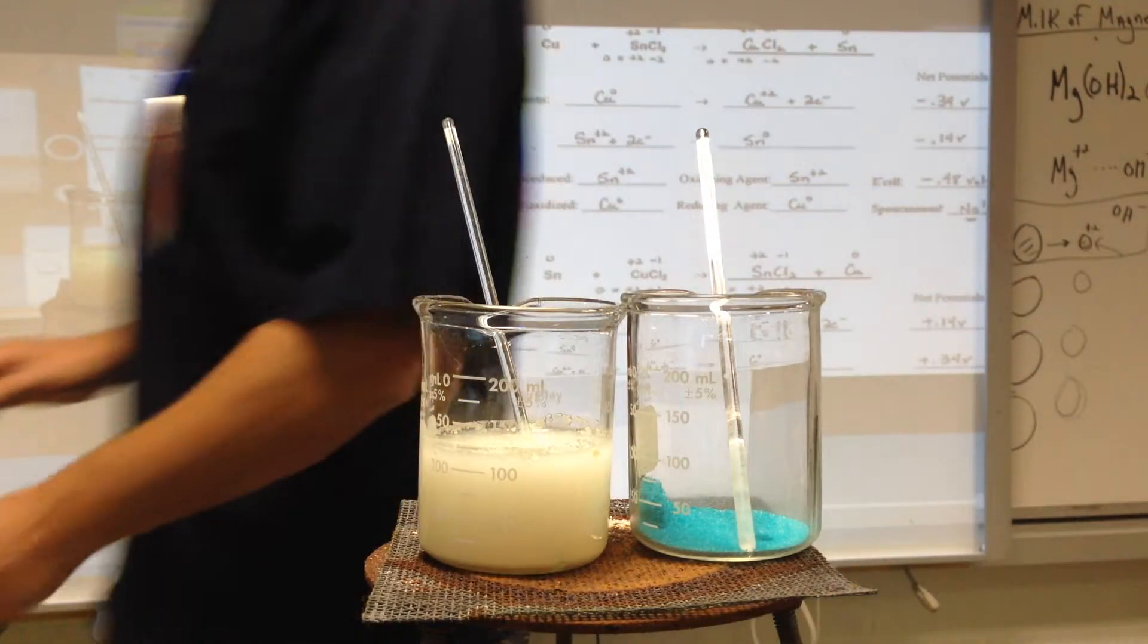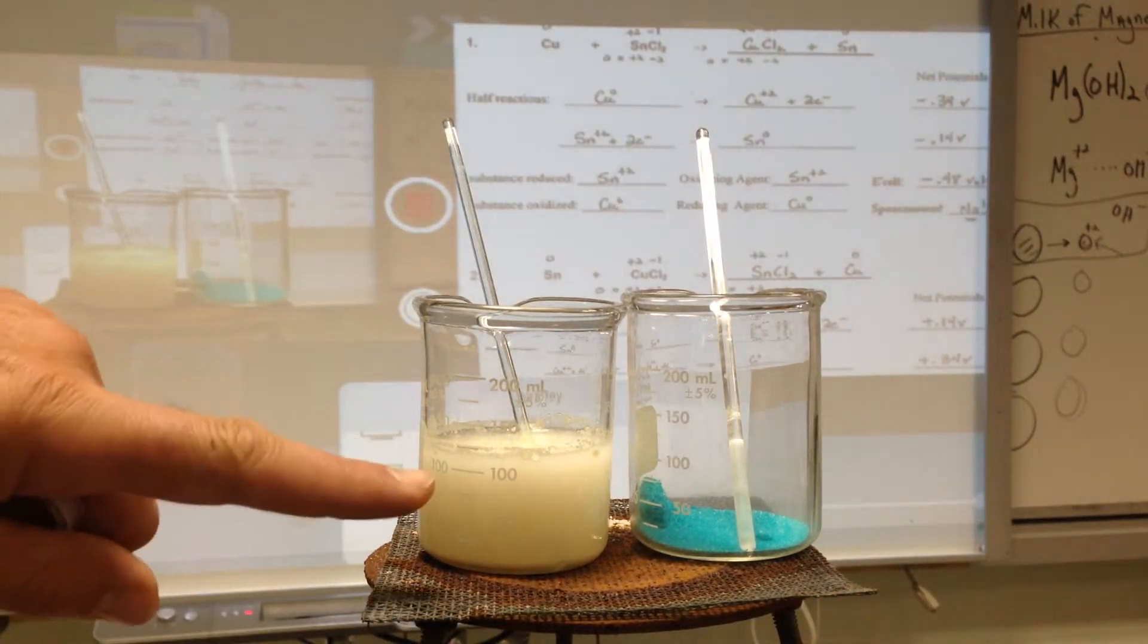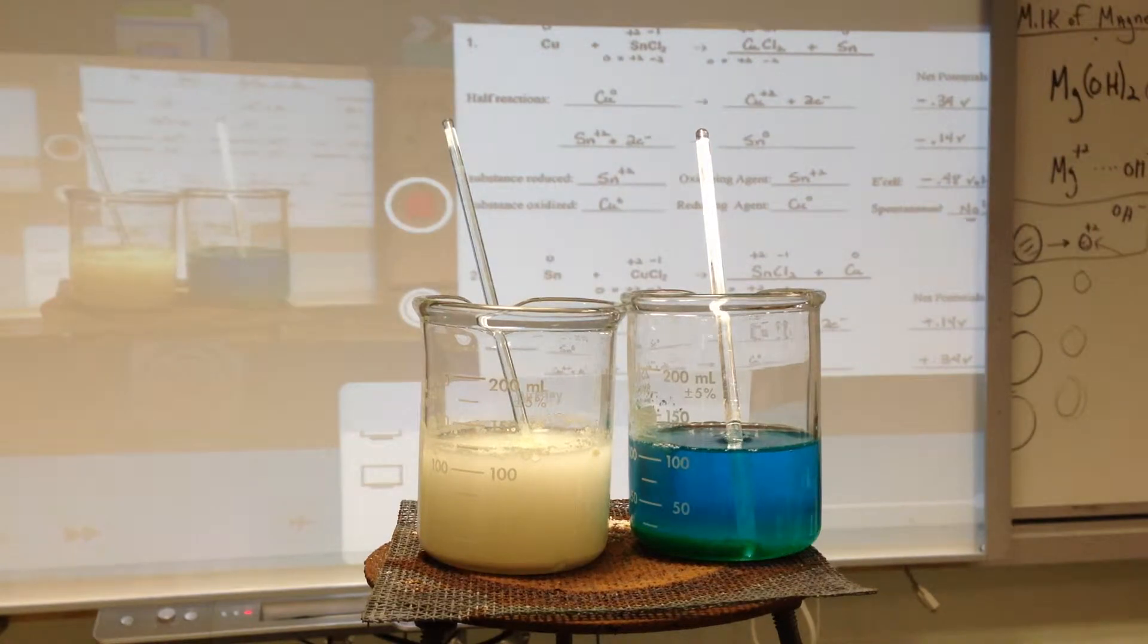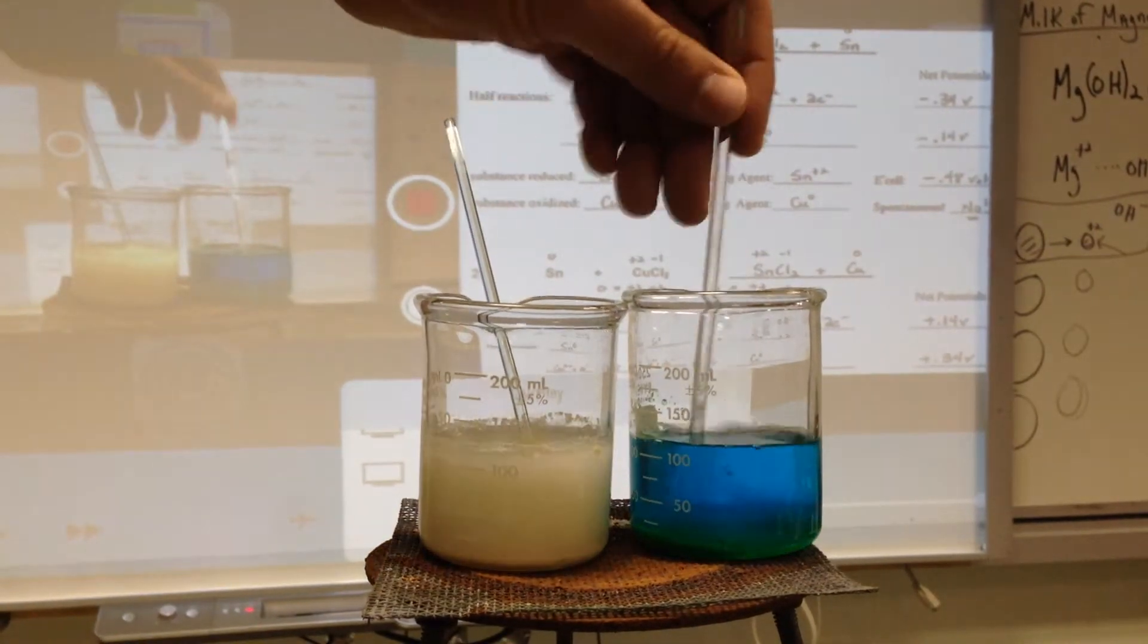I've got the tin chloride to the left, and I'm going to add some water to some copper two chloride. That does dissolve and gives you that greenish blue color, although with my color blindness, it's tough to figure out exactly.